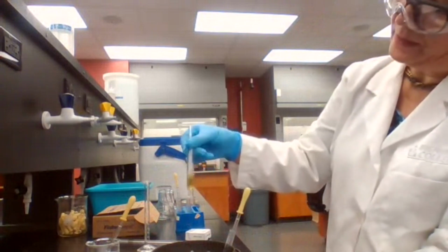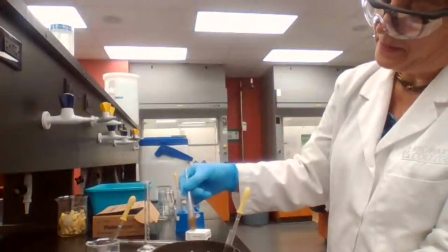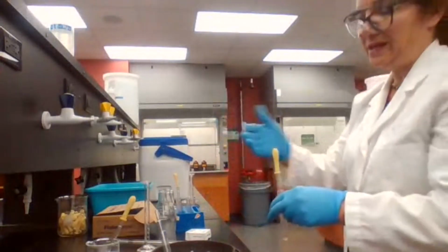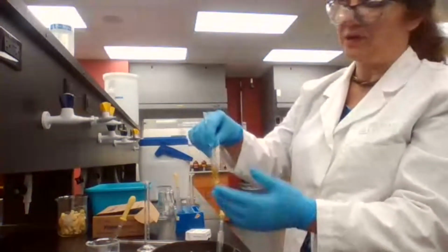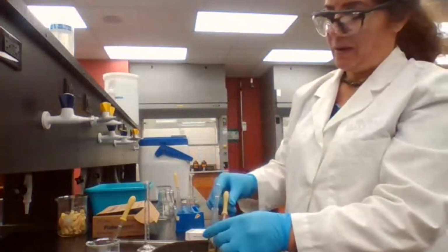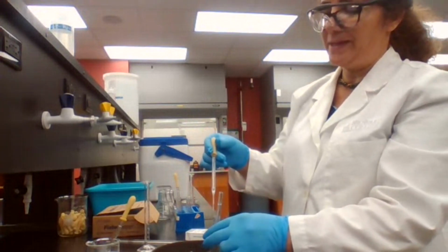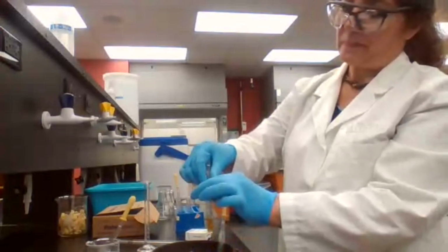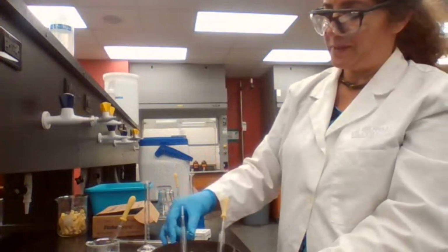Going to continue also with the methyl benzoate from last lab. Even though it looks very similar, I still have two sets of experiments. I'm doing two experiments at the same time, in parallel, because we have time. We are waiting 15 minutes for the other reaction mixtures to get ready, so while waiting, I'm also trying the methyl benzoate we prepared last class. It's better to have two samples in case one works better than the other.